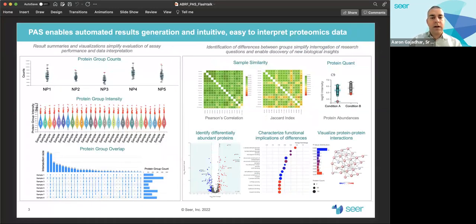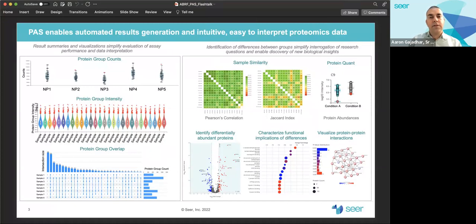PAUSE enables automated results generation and intuitive, easy-to-interpret proteomics visualizations to evaluate assay performance. Some of these analyses include displaying protein group counts and intensities, understanding how protein groups overlap across samples, and similarity of samples based on correlation and Jaccard index. PAUSE also supports characterization of group differences so you can quickly understand biological insights using the built-in differential analysis and functional enrichment tools.